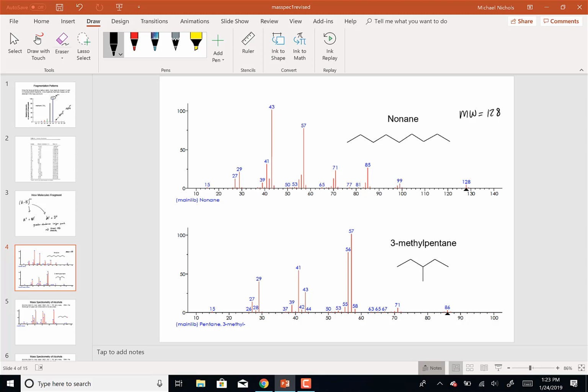Technically, the x-axis is the mass to charge ratio, but since the charge is +1, it's simply the mass. If we do biomolecular mass spectrometry, sometimes molecules can have a +2 or a +3 charge, and that just complicates everything, because then when you get a number, is it ×1, ×2, or ×3? But in our system, since we're doing small molecules, it's only +1.